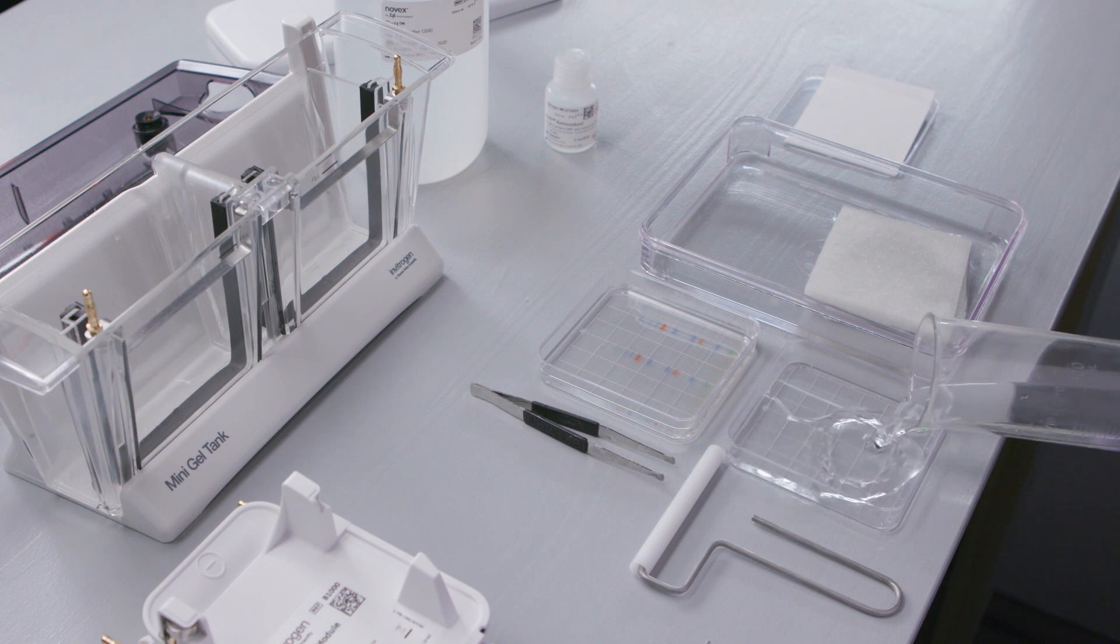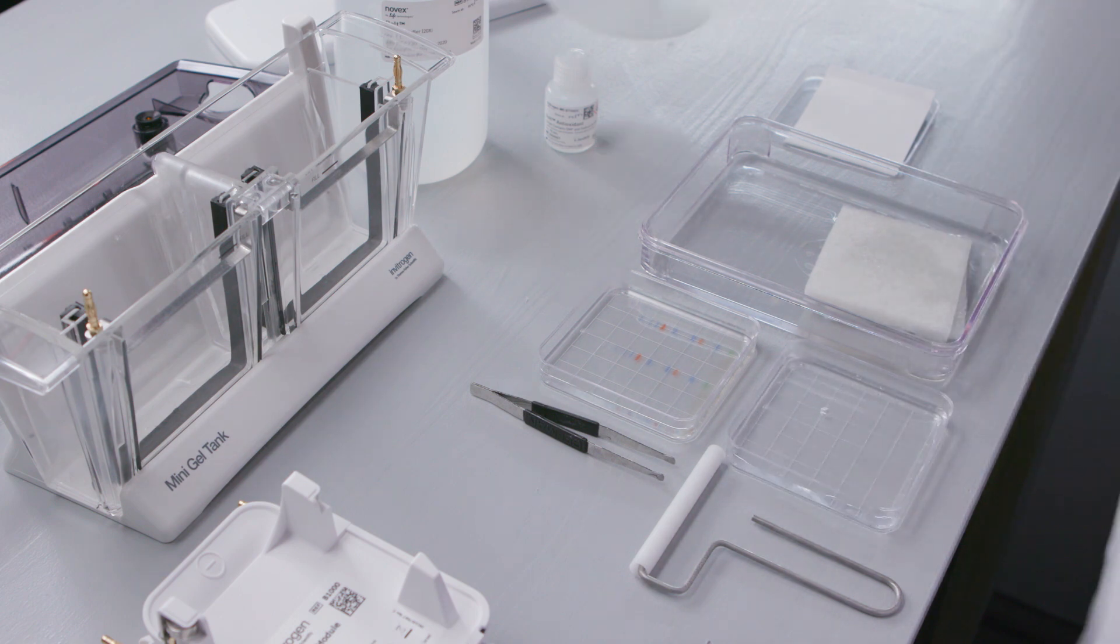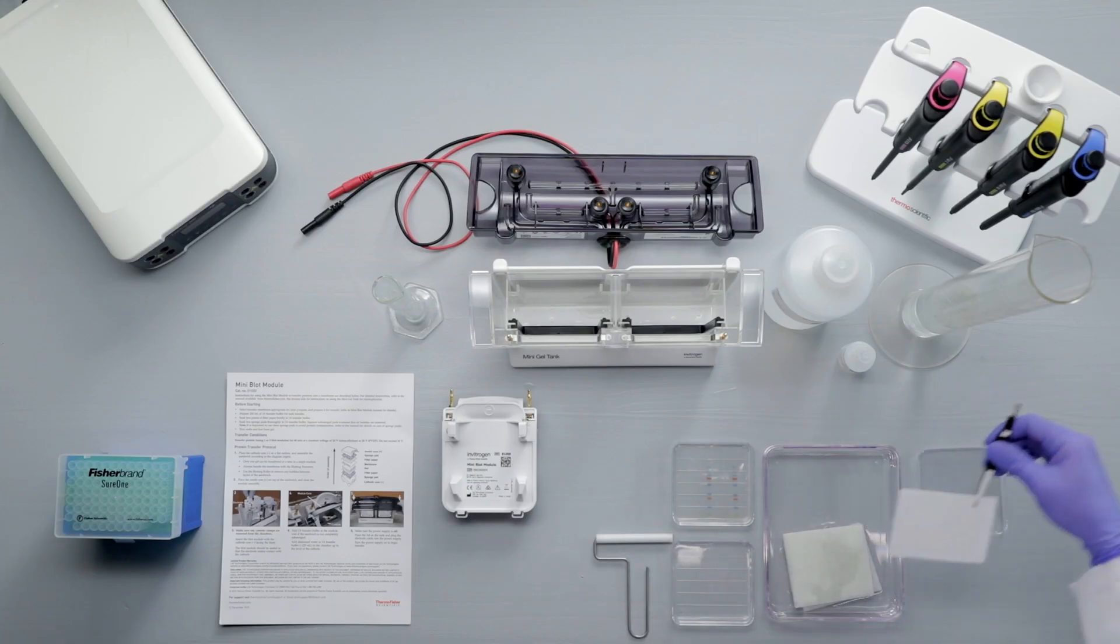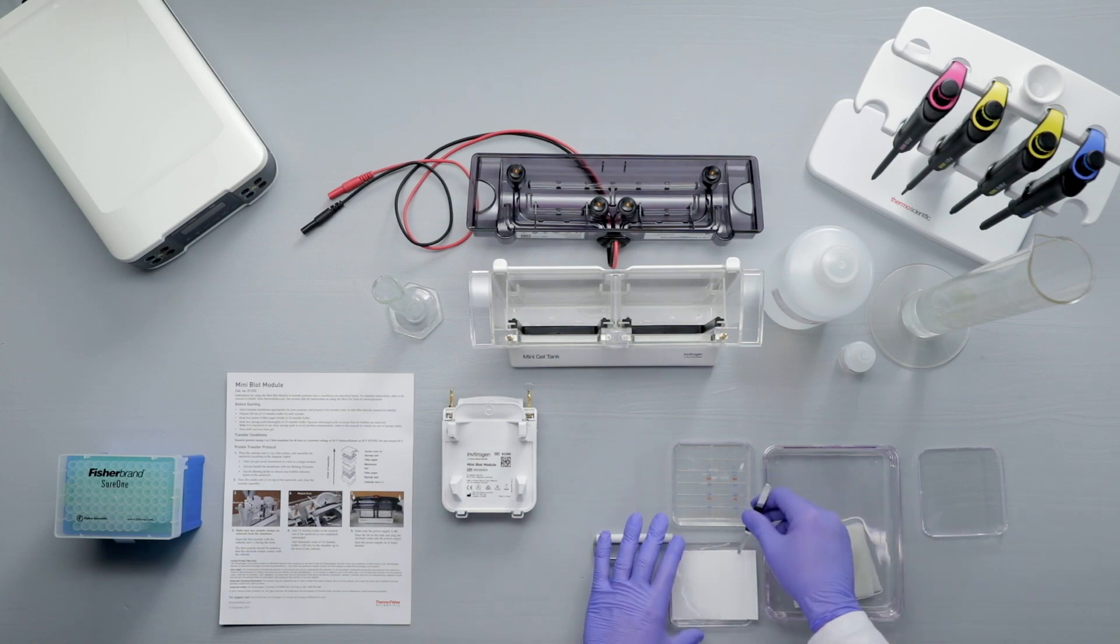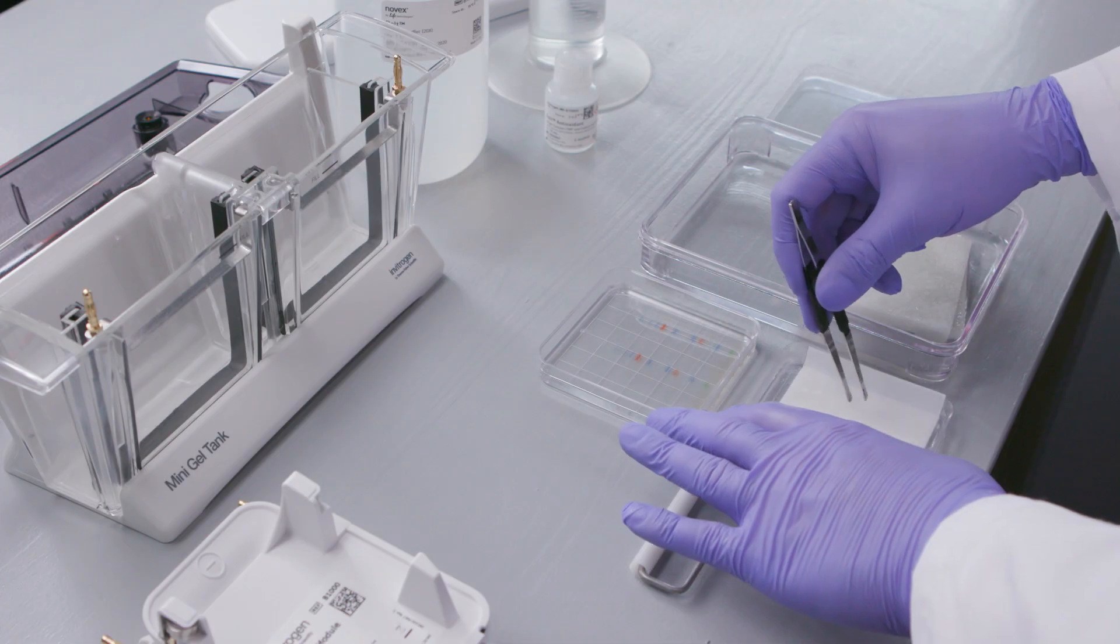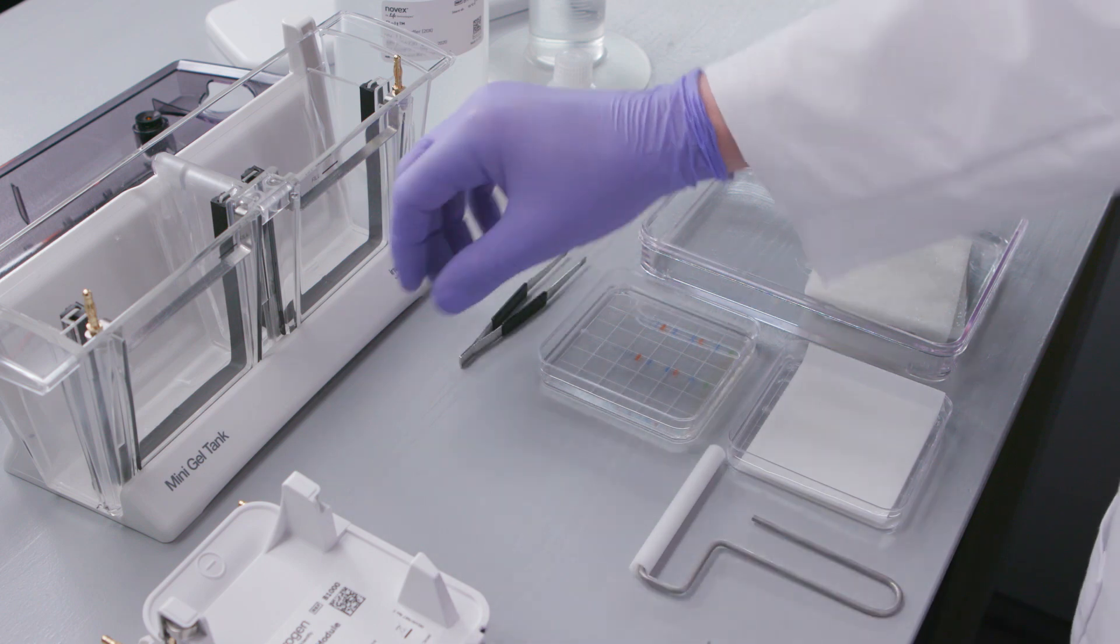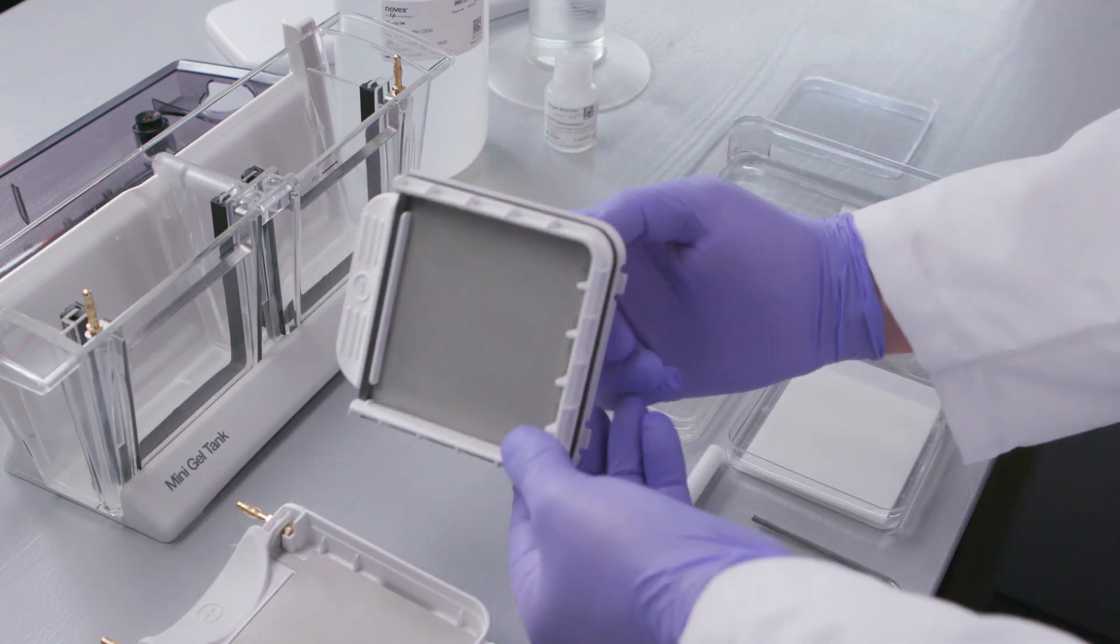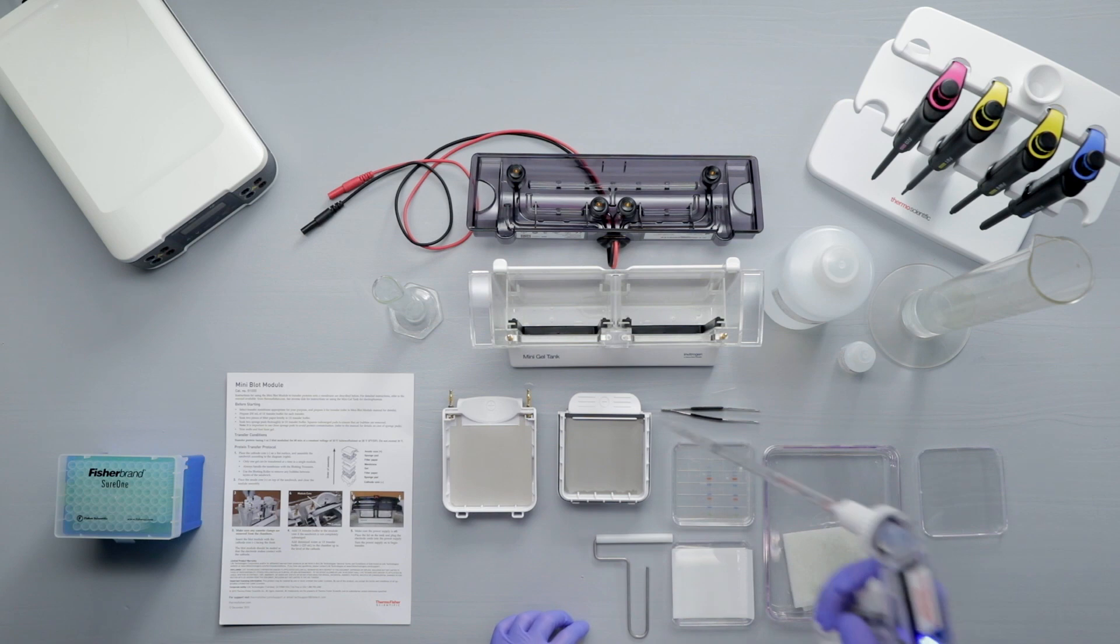Place a shallow dish on the bench and pour 1X transfer buffer to dip the filter papers into during sandwich assembly. Assemble the western transfer sandwich by placing the cathode or negative core on a flat surface. Pour five milliliters of transfer buffer into the core.